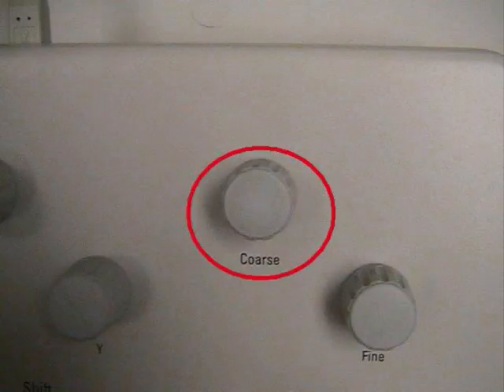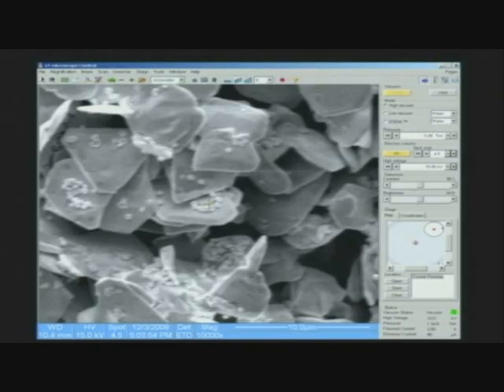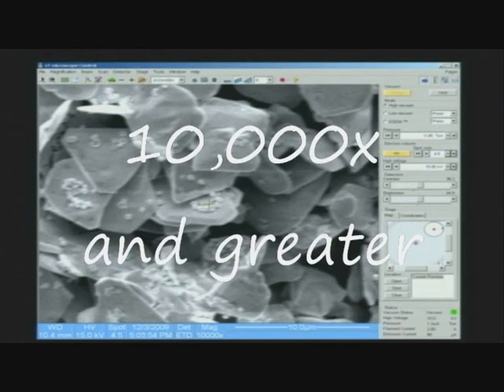We will demonstrate the process of focusing the SEM. The first step is to use the coarse focus to bring out defined shape. Next, we will use the fine focus knob to bring out the details of these shapes. During this process, you may have noticed that we focused only a small area at once. This is because focusing the beam in a smaller area allows for adjustments to be made more easily to bring out certain features. Now that we have discussed focusing in general, we will talk about focusing at higher magnification.